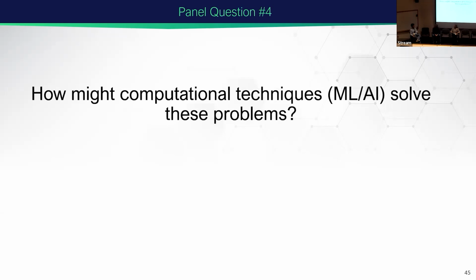Yeah. So that's one. And also one issue is, in any of this data analysis, statistical analysis, or machine learning, currently there is no good strategy for normalization. Of course, normalization is a general problem in mass spec imaging because depending on the sample types and your biological questions, how you normalize will affect your result.